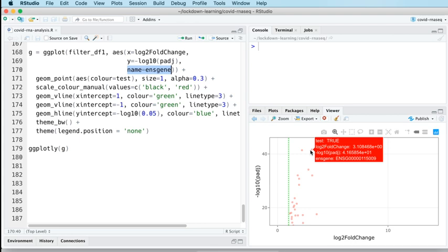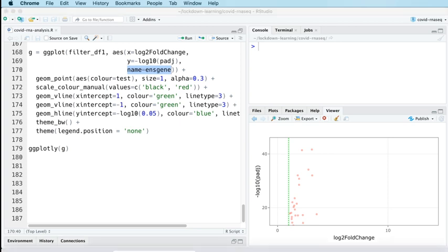So that's our goal for today, to map the Ensembl gene IDs that we have, which are the only identifiers for our genes, to other information to make our tables richer and our plots richer, and so on and so forth. Okay, so how are we going to get that annotation? There's lots and lots of ways of doing this.